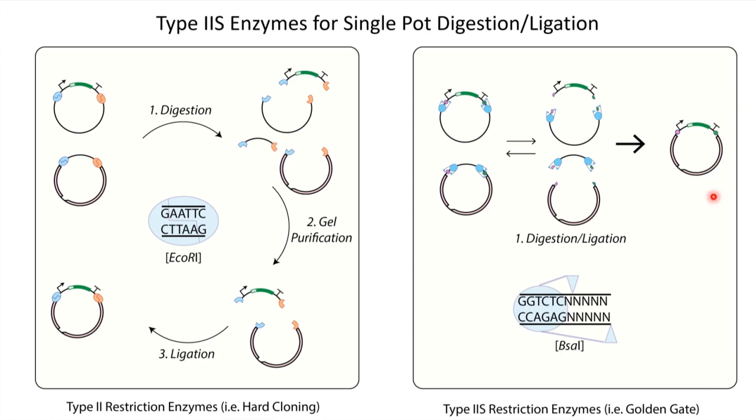It cannot be redigested. If these intermediate fragments religate in an unwanted ligation, for example, let's say they go back and form the substrate plasmids again, you reintroduce those restriction recognition sites, and these substrate plasmids can be redigested to form these intermediates again. And so anytime you have a setup like this, where you have some equilibrium between substrates and intermediates, and then a non-reversible step to get to the product of interest, there's a principle called Le Chatelier's principle, which you might remember from your intro to chemistry classes as undergrads, that's going to drive this reaction towards the formation of your plasmid of interest.